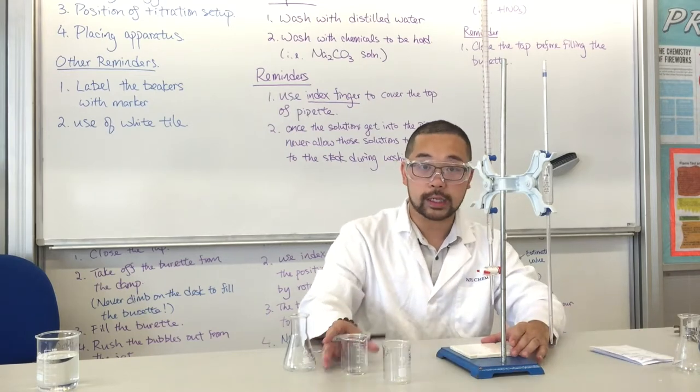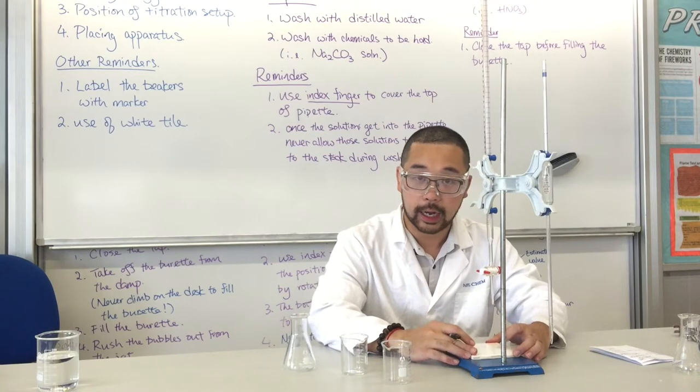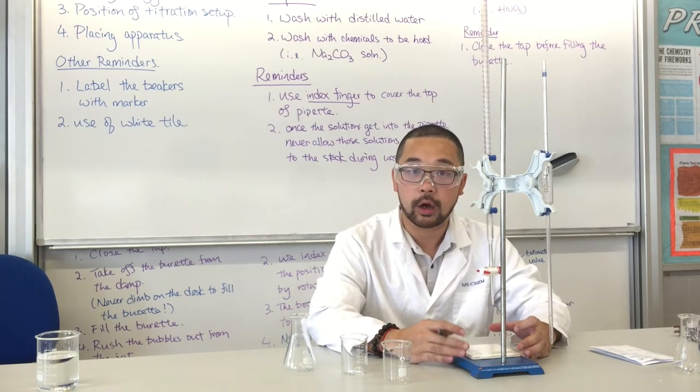Last one is about the white tile. You should have a white tile on the stand and clamp, in order to have a better observation of the color.